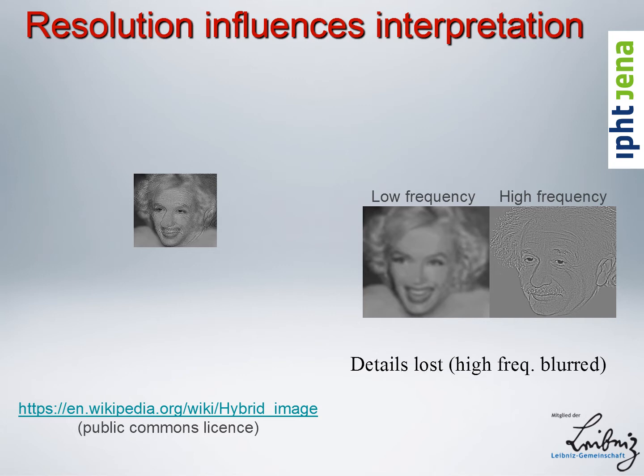And then you can suddenly resolve that they are both in the mitochondria of these cells. You can still not separate them somehow, but they're in the mitochondria. When you then get super resolution images at maybe 100 nanometer resolution, you can suddenly start to see that one dye, let's say the red dye, is in the membrane, whereas the green dye would localize to the lumen of the mitochondria. So that's a similar phenomenon. When you have high enough resolution, you can suddenly discern a difference, and that changes massively your molecular interpretation.